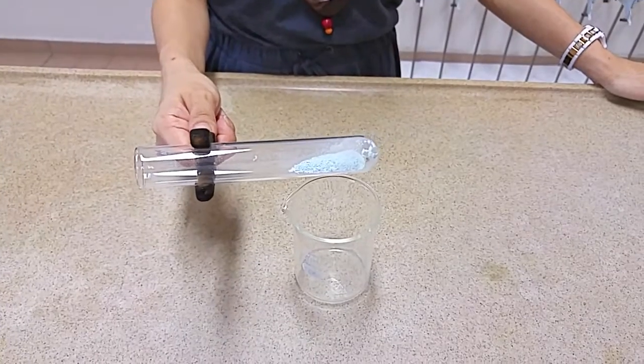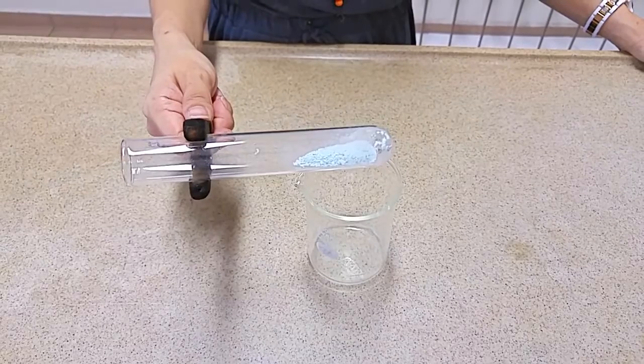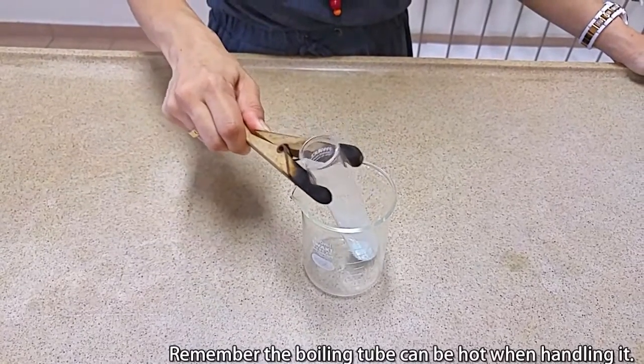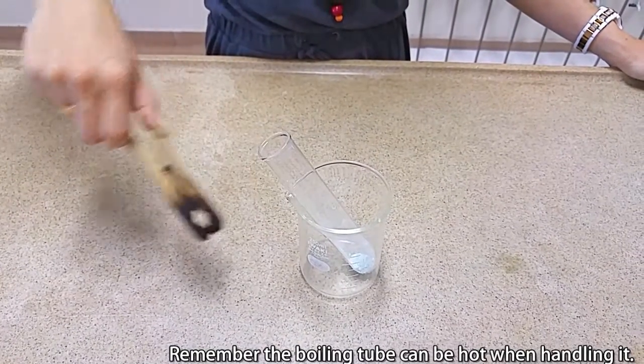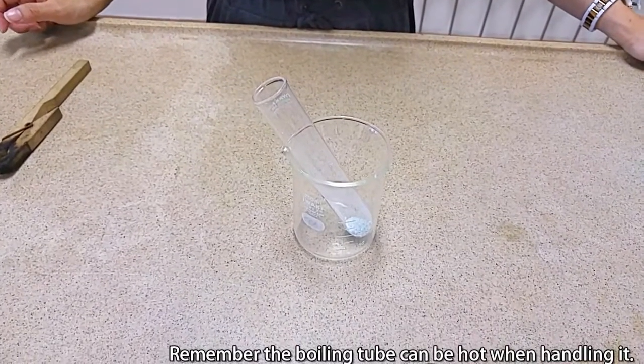So this will be the final product that you'll see at the end of the heating. This is the anhydrous copper sulfate. Put it in the beaker and let it cool. When it is cool, bring it to the weighing balance and weigh.